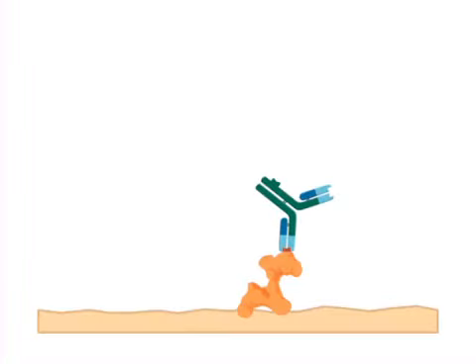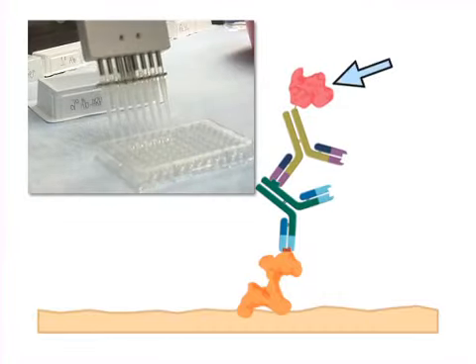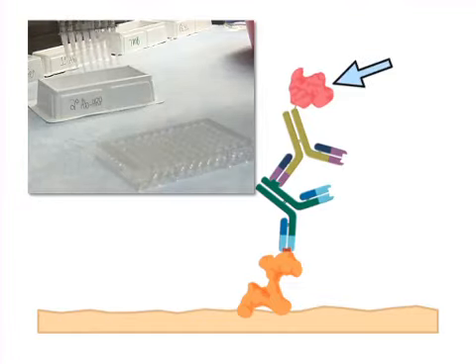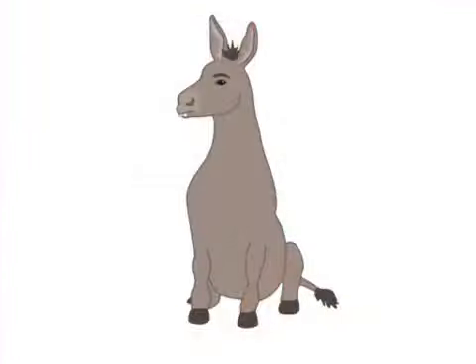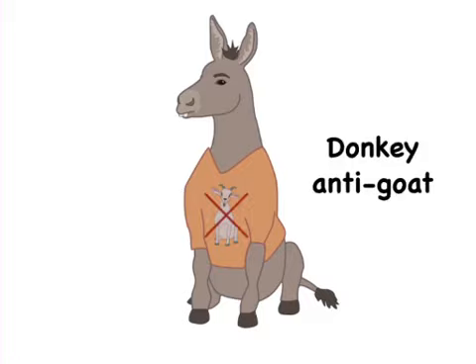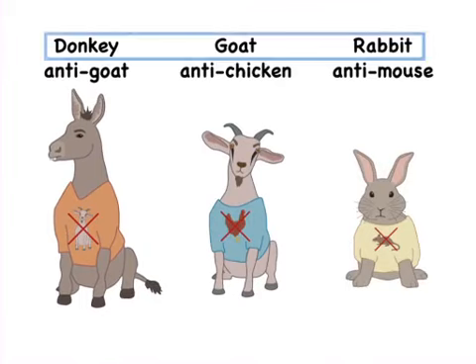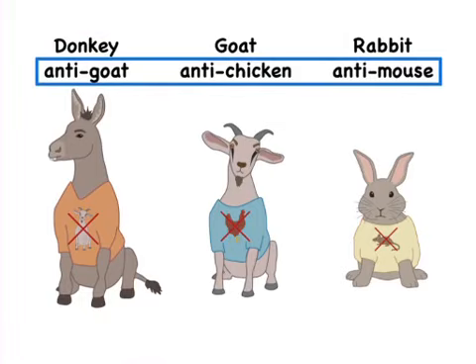The secondary antibody in an ELISA is the antibody used to recognize the primary antibody. This antibody is usually conjugated to an enzyme. Sometimes the secondary antibody has a funky name. For example, if the antibody was made or raised in a donkey to recognize a primary antibody raised in a goat, the secondary antibody would be called a donkey anti-goat antibody. When it comes to naming secondary antibodies, the first name indicates the organism that produced the secondary antibody, and the second name represents the organism that produces the primary antibody.